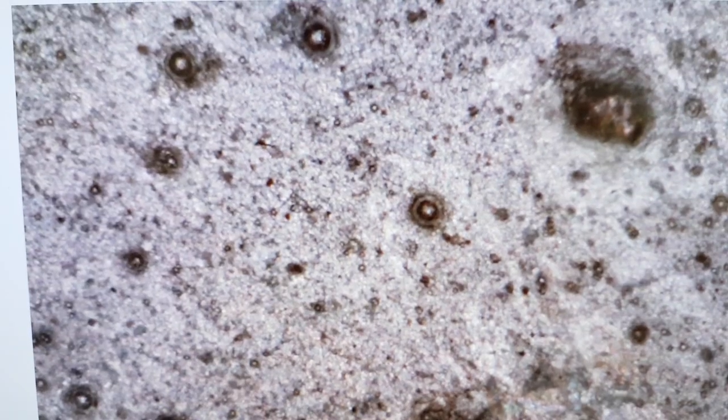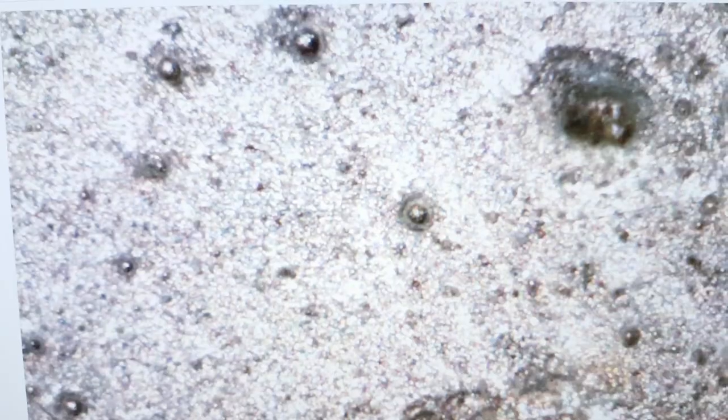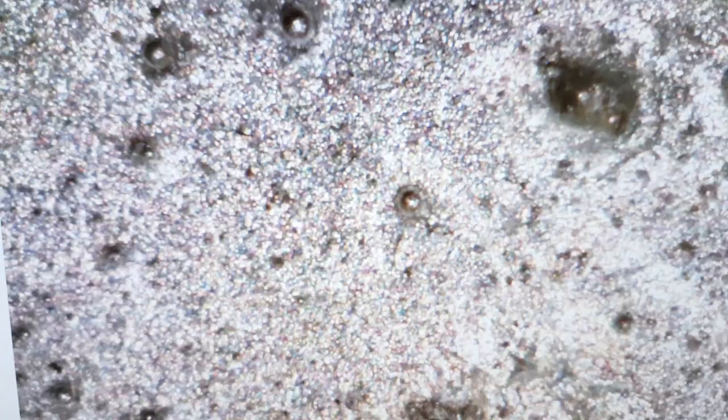I'm looking forward to looking at this under the SEM and maybe even trying to use these four point illuminations to create a 3D map to understand the topology of these structures.